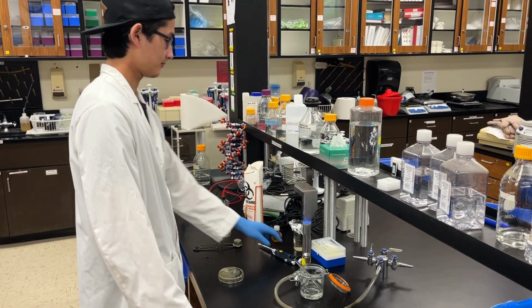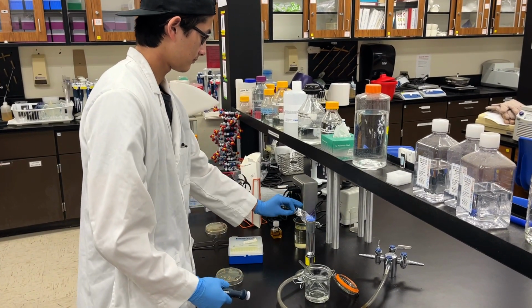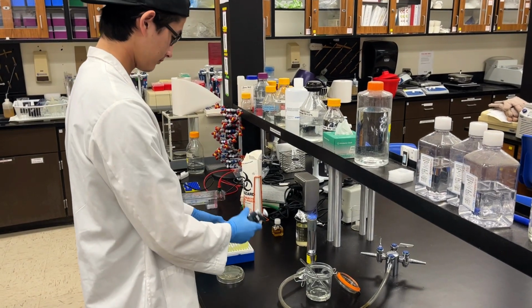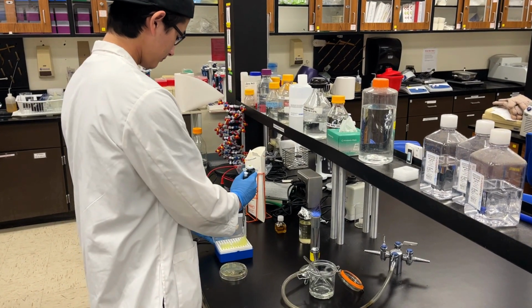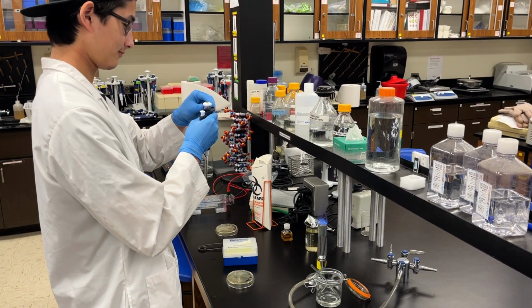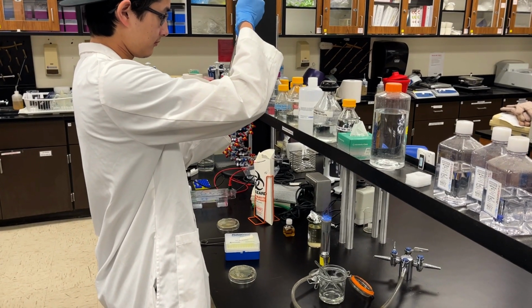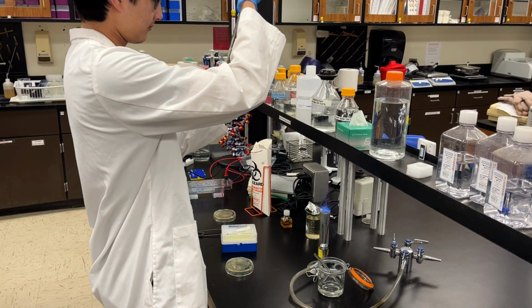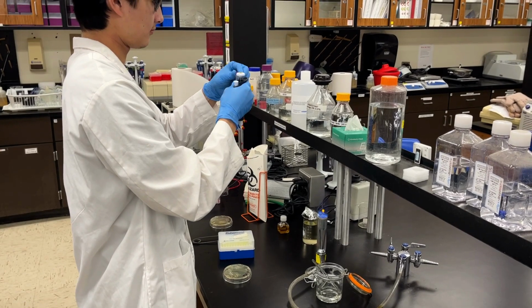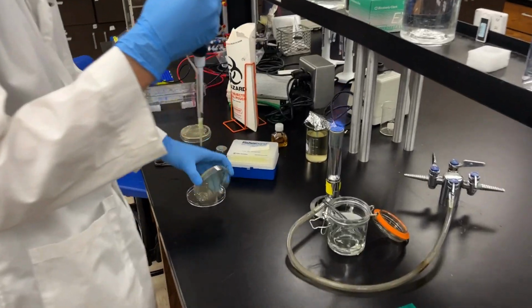The last step is to plate your cells onto agar that contains the appropriate antibiotic, the one that is on the plasmid. To do that, simply plate a certain amount of cells onto the agar. The amount is going to vary, and it's always going to be dependent on the expected transformation efficiency. And later I'll show you some pictures of what it looks like when we have an inappropriate amount. In this case, Jaden is using 50 microliters.